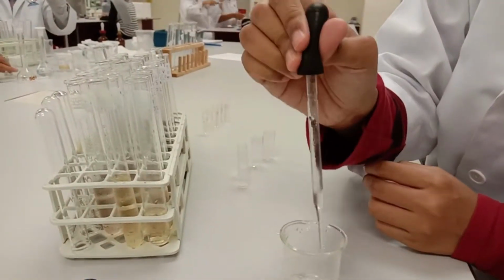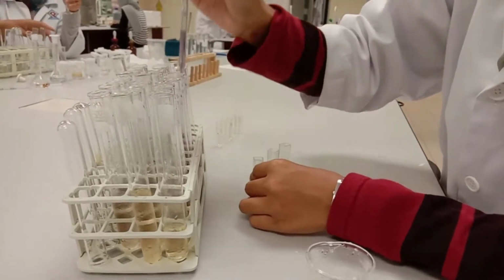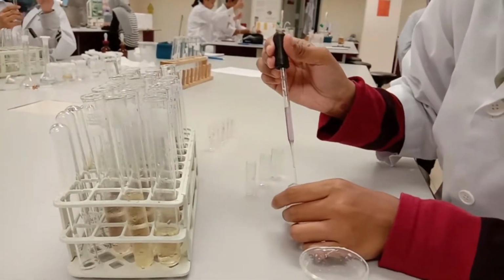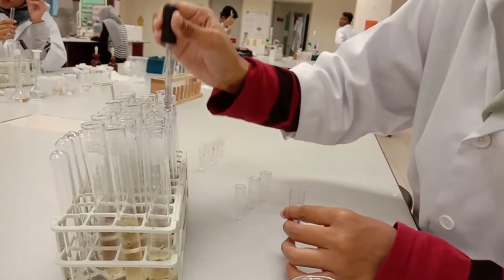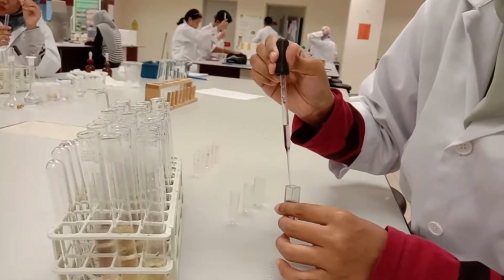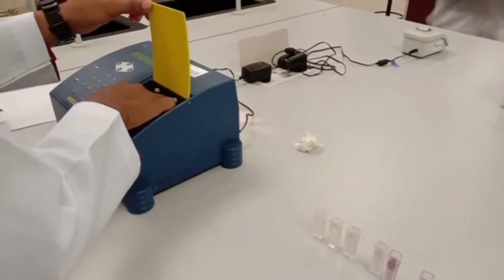After 2 to 3 minutes in the ice, all the solutions in the test tubes were taken out. 9 cuvettes were prepared for the solutions. Each solution was filled into a cuvette. Only 3/4 of the cuvette was filled by the solution to be measured using the spectrophotometer.